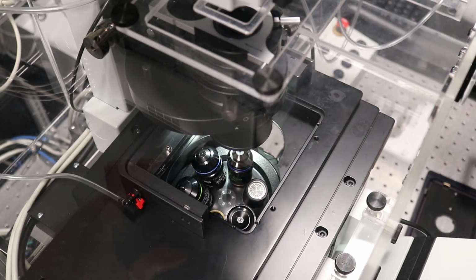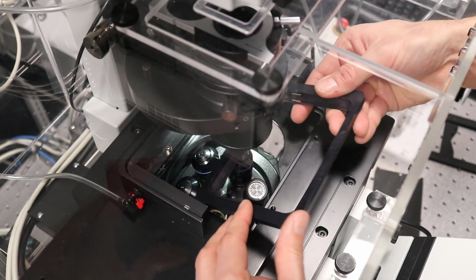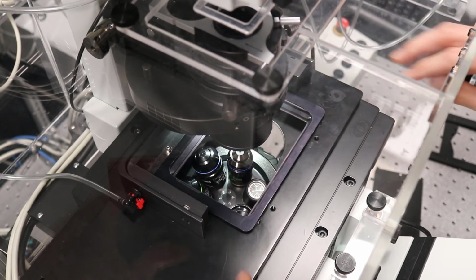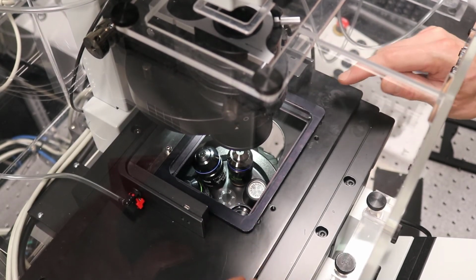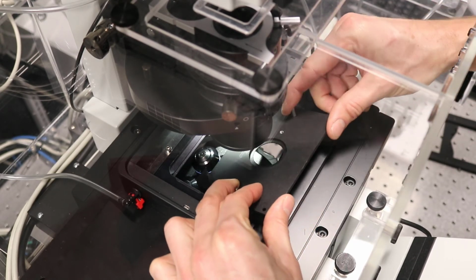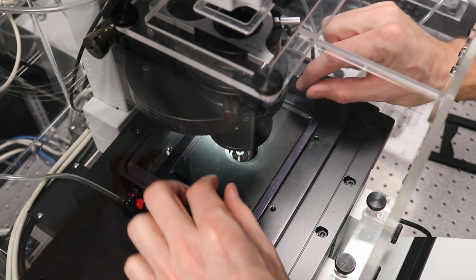If you use plates, you have the other insert. And this one is slid in the same way. Right now it fits with the 96 well plates. But maybe you have Petri dishes or other formats, you need to insert them in an insert like this, either this one or one of the custom-made ones.